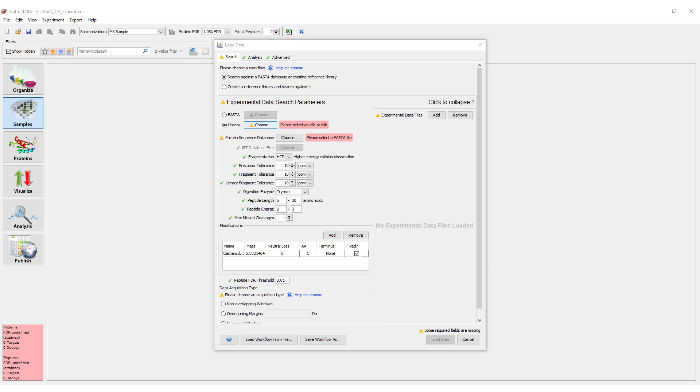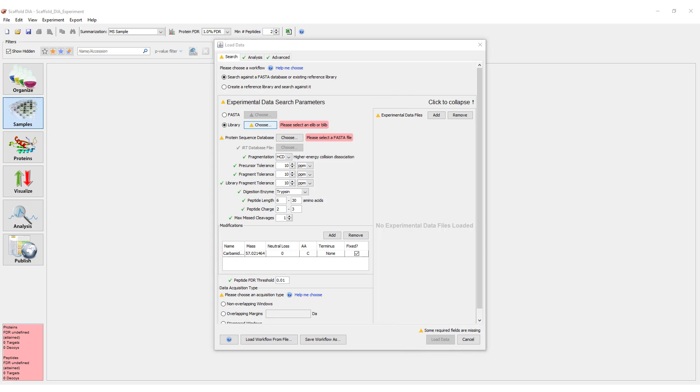We begin in the Search tab where the bulk of the settings live. Note that the yellow triangles scattered throughout the workflow are an indication that the user's attention is required. Once the triangles are cleared, data processing can begin.